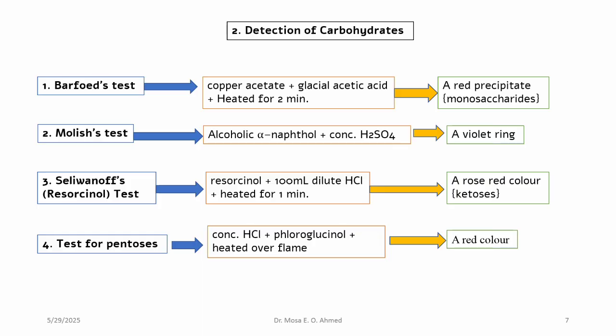Seliwanoff's test, also known as resorcinol test, consists of resorcinol plus dilute HCl and heating for 1 minute. For ketoses, resorcinol test gives a rose red color.